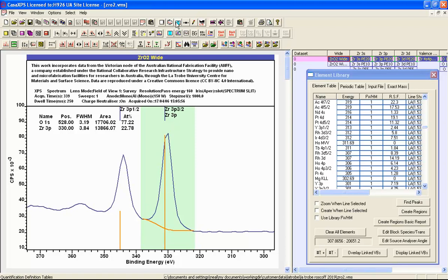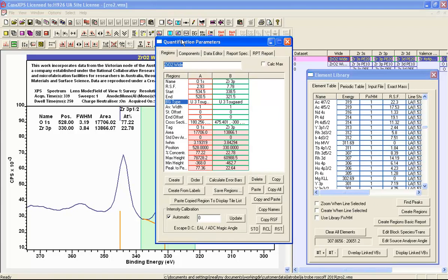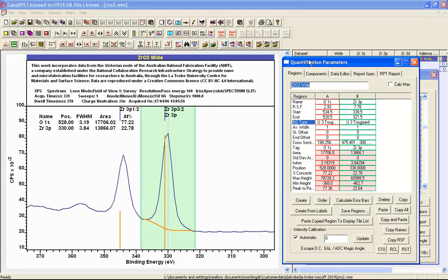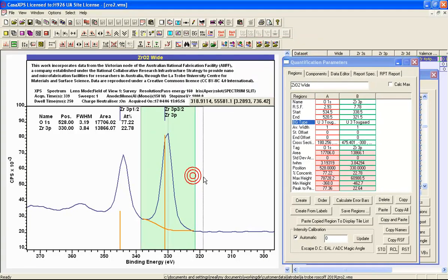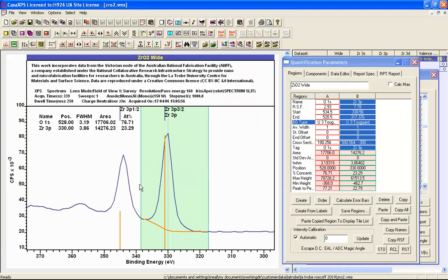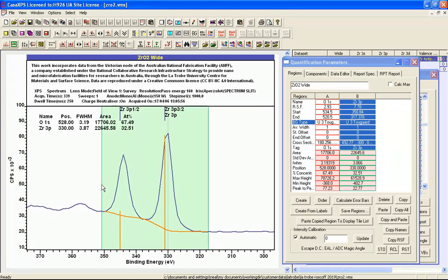To obtain a proper quantification, the region needs to be adjusted. In this case we need to include both parts of this doublet peak in order to obtain a quantification that looks plausible for zirconium oxide, where there are two oxygen to each zirconium atom.